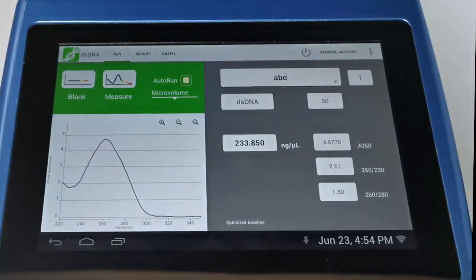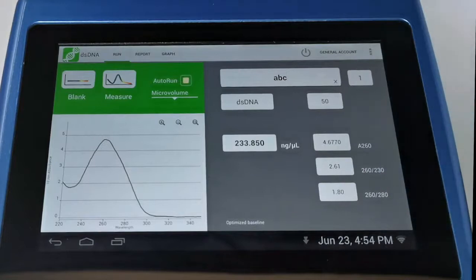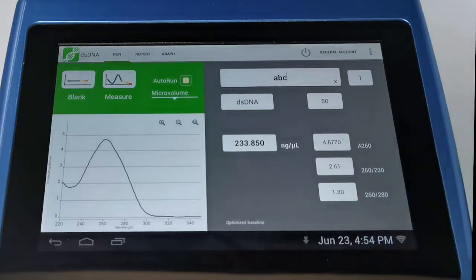The data is displayed here on the right hand side. So you'll see we have a concentration in nanograms per microliter for double-stranded DNA. We have the absorbance value, and then we also have two purity ratios. And the purity ratios allow us to get an idea of if there's any contamination, either through proteins or salts that may be co-extracted with our DNA extractions.